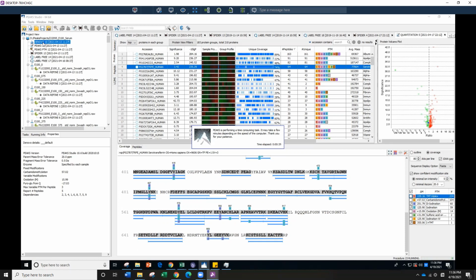It's still taking. I'm running out of stuff to say. Yes, and I don't know how long it will take, but when you run analysis, there's analysis open and running, so it will take a while for you to open each tab.